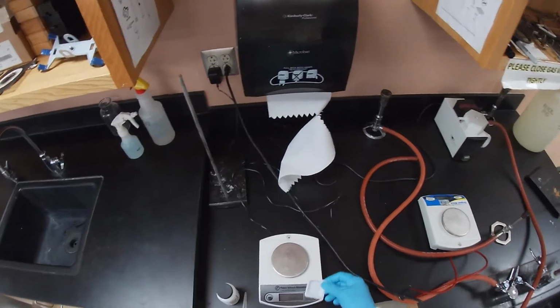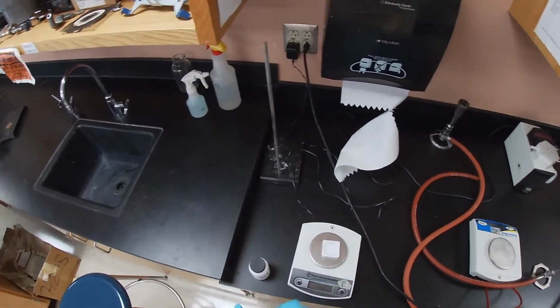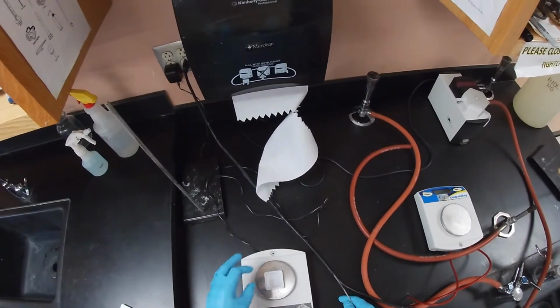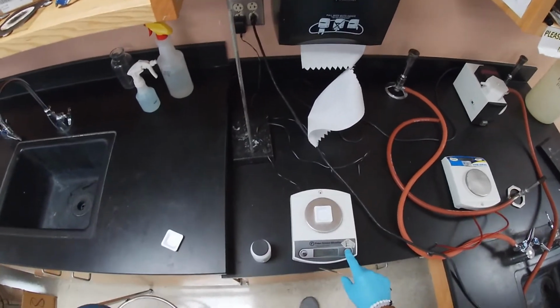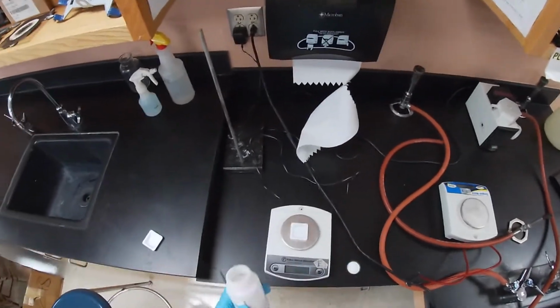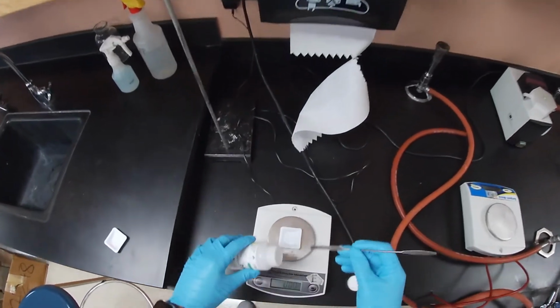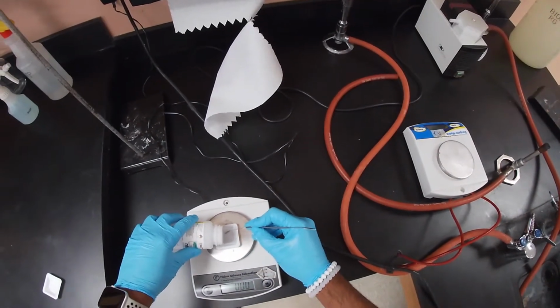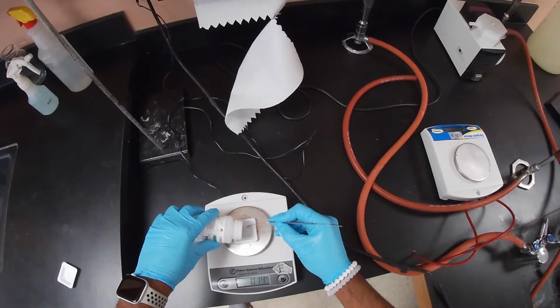And so here we have our scale and we have our weighing boat. And so what we're going to do is we're going to try to center it as much as possible. And then we're going to zero it out and we're going to measure out 3 grams approximately. Okay. And so whatever we measure out, we just got to make sure to write it down, right? And so we want to get about 3 grams.